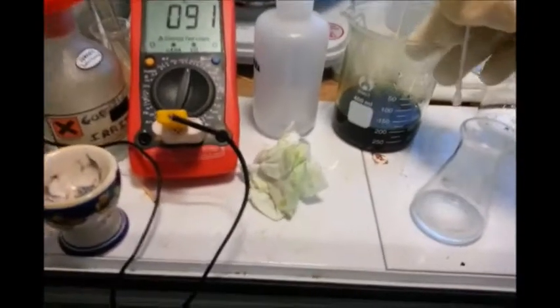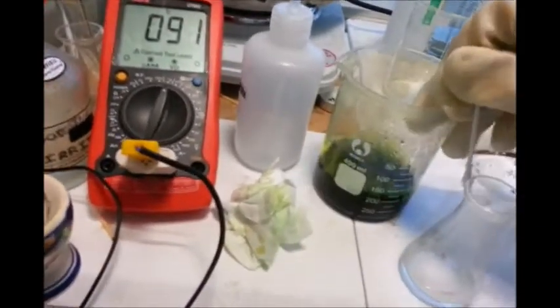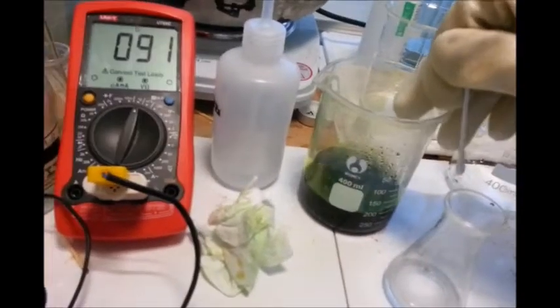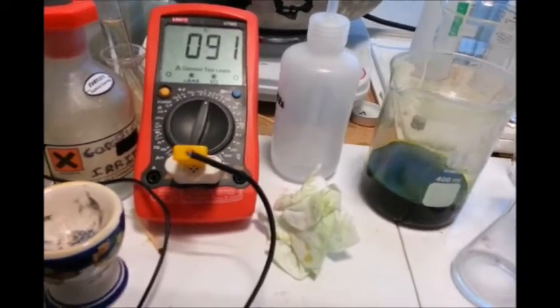Now we've got our solution — all the pins are now dissolved in there. As you'll see I've moved to a bigger container; I had to add more acid and more water and so on to accommodate all of the metal ions.